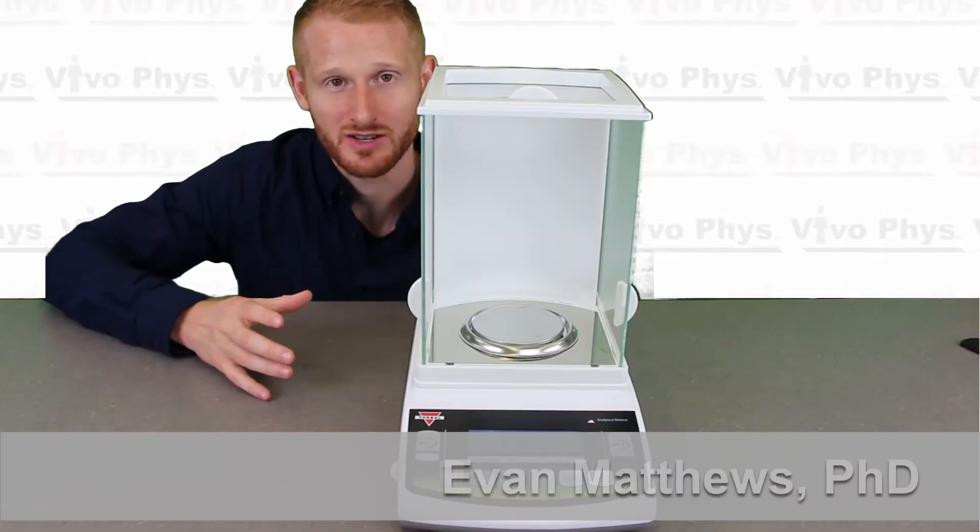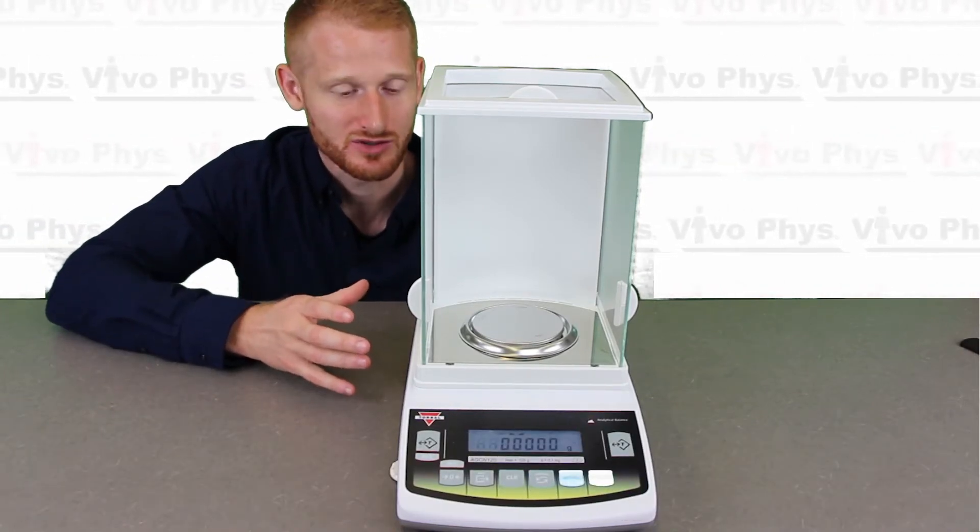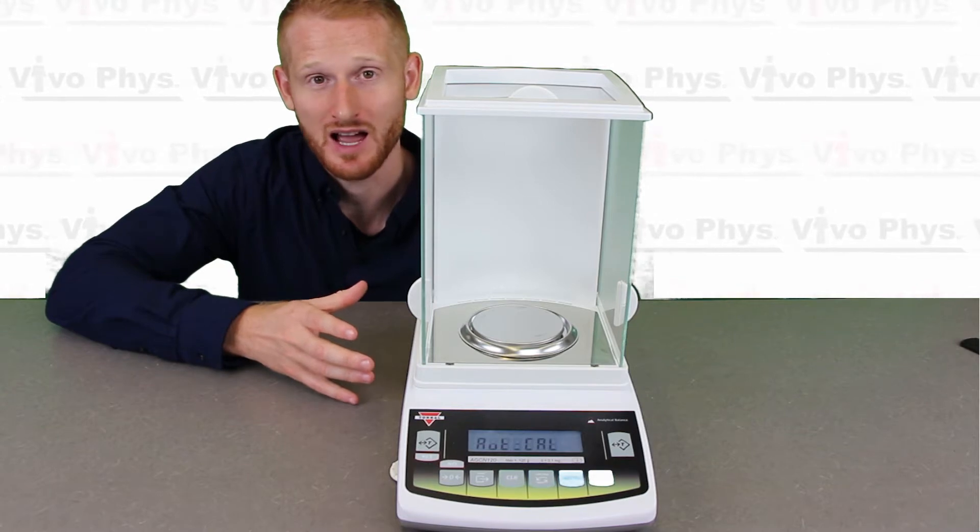Hi, I'm Dr. Edward Matthews. I'm here at Montclair State University in the exercise science lab to show you how to use a precision scale, which is used in biochemistry labs all over the world.